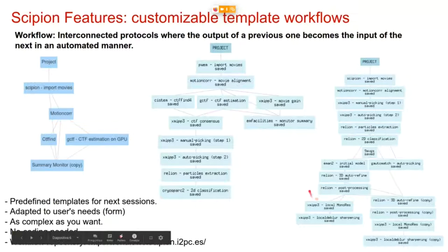From the point of view of the facilities, they can use a standard or basic workflow for the user, or they can ask the user prior to the visit which programs they would like to use to make a workflow adapted to their preferences. In order to make these workflows, there's no coding needed. Just as we will see later, it's all done through the graphical user interface. And I'd like to say that there is a workflow repository where you can upload the workflows you make or download the workflows that the community has uploaded.